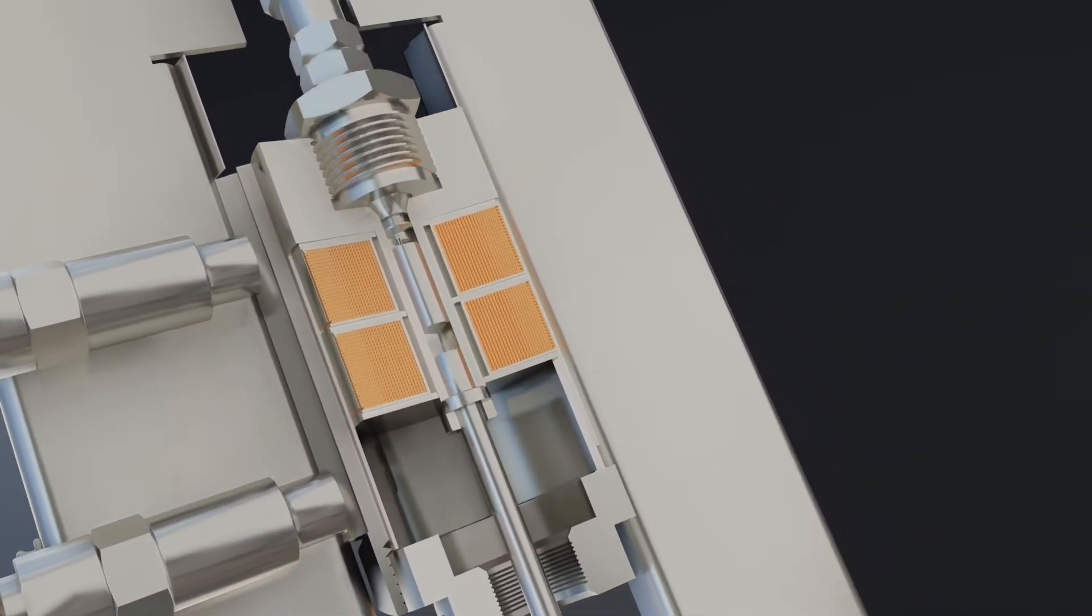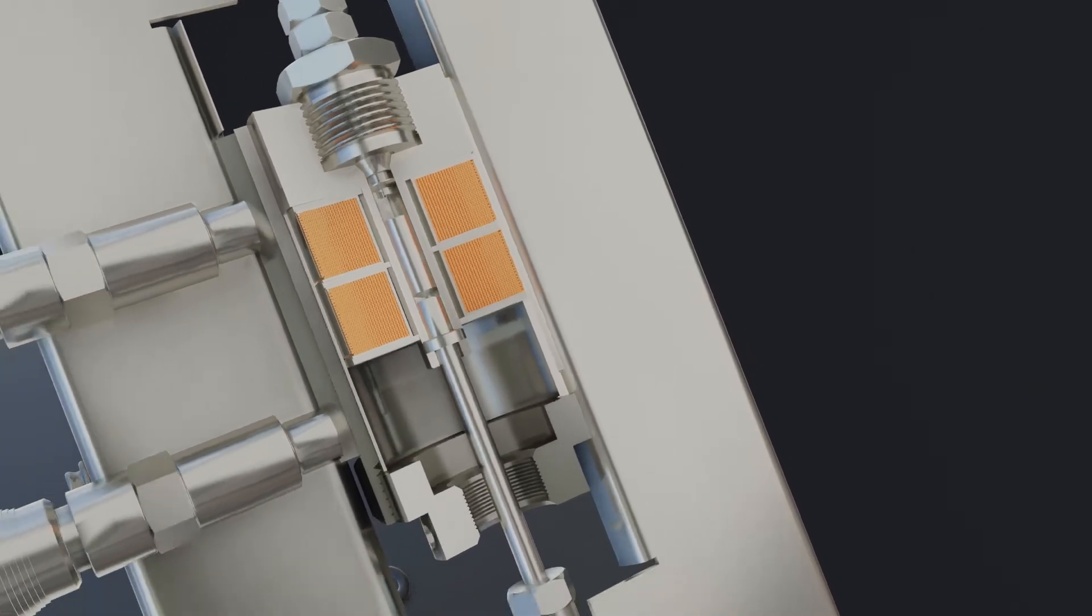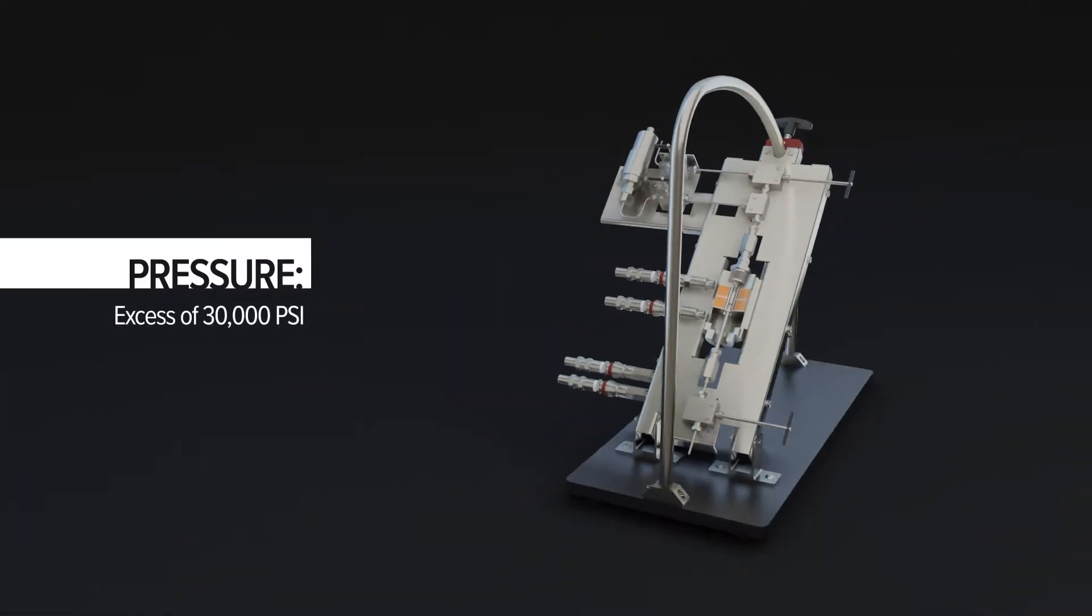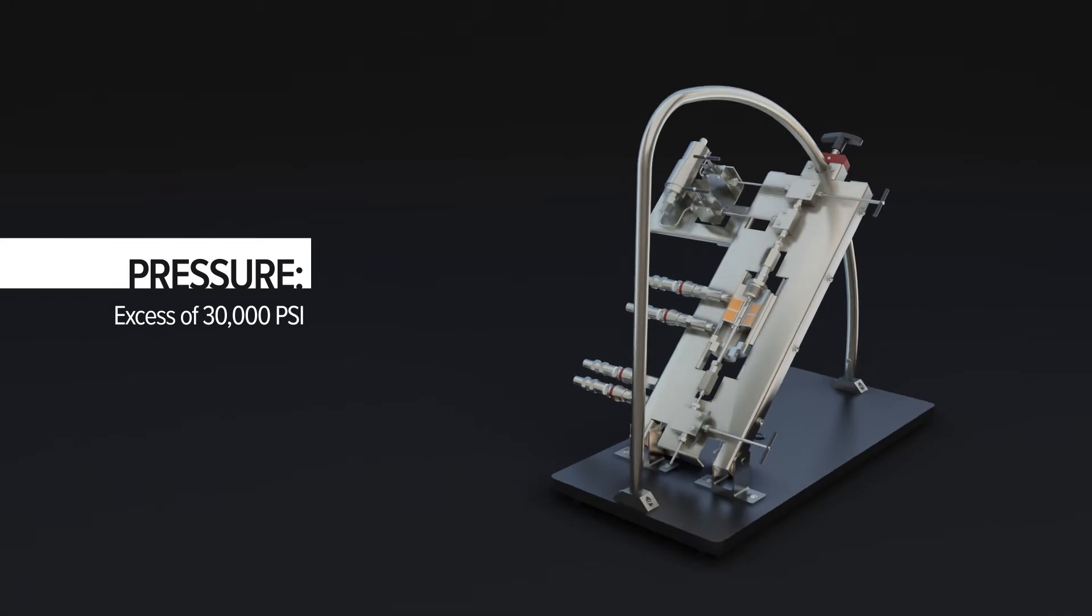ViscoLab PVT Plus sensors can measure pressures in excess of 30,000 psi and temperatures up to 315 degrees Celsius.